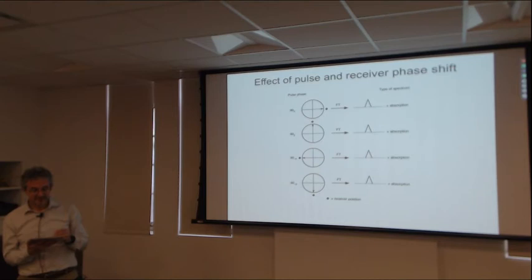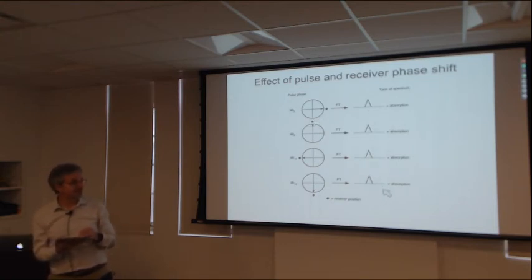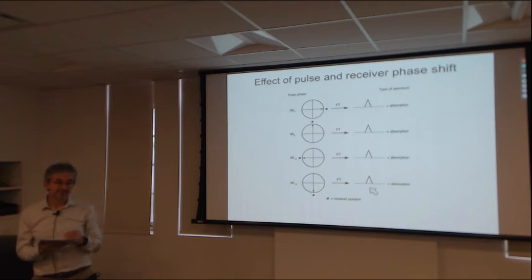And then if I want to accumulate the signal, every time the magnetization is shifted in phase, the receiver has to shift in phase to follow. And then I'll get the same phase signal every time, and I can add them up. And I get a signal.